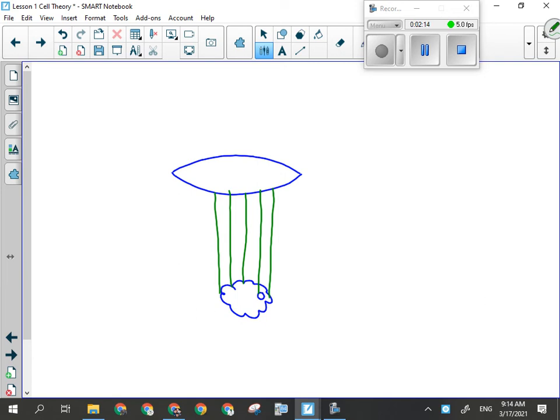It's how a jeweler can tell the difference between a cubic zirconia and a real diamond. All they have to do is look at the angle that the stone is cut at. In order for cubic zirconias to sparkle like a real diamond, they have to be cut at a different angle in order to make the light disperse the way it does. All materials refract and bend light a little bit differently, called their index of refraction. So this light that comes from the specimen hits this lens.